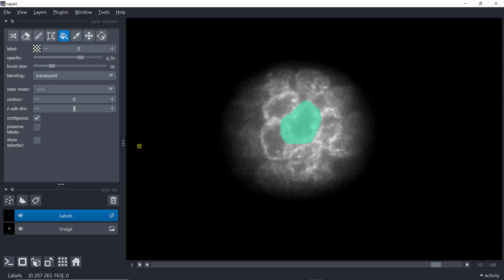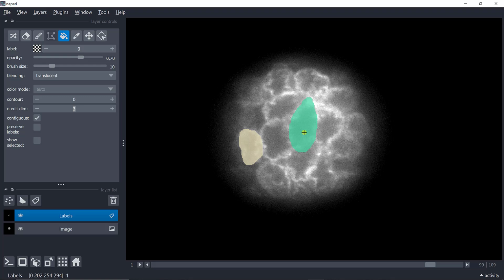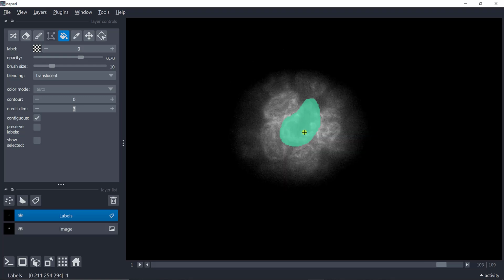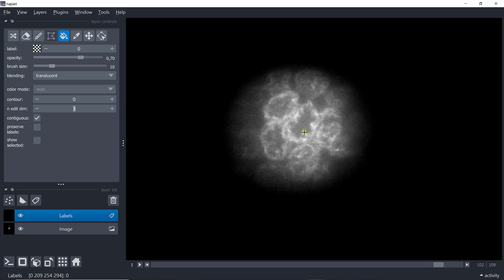Now, if I go to 3D, so here I have several of them, you see, 1, 2, 3, 4. Now, if I remove this one, it's all gone, except, you know, the last part that wasn't gone. But if I click on it now, everything is gone.